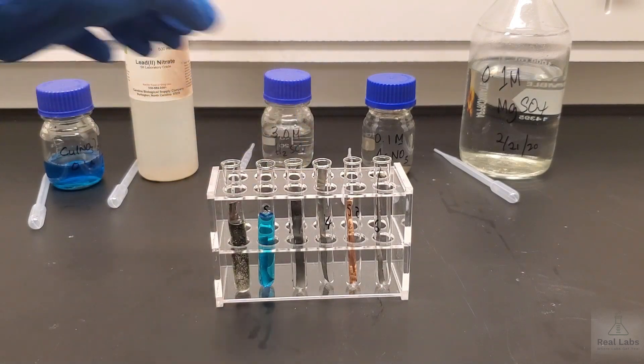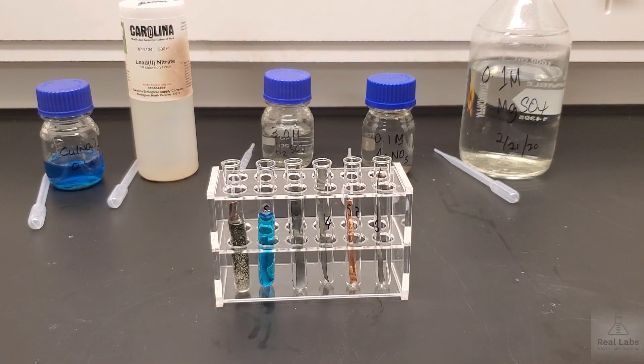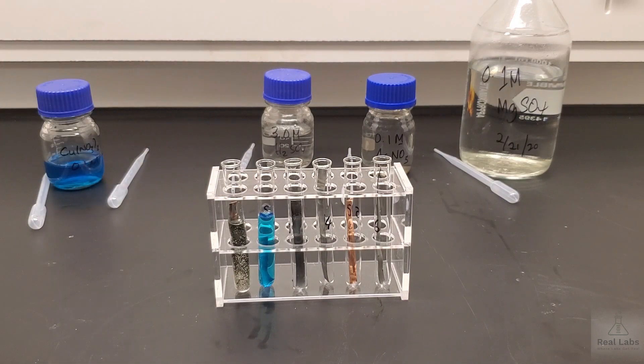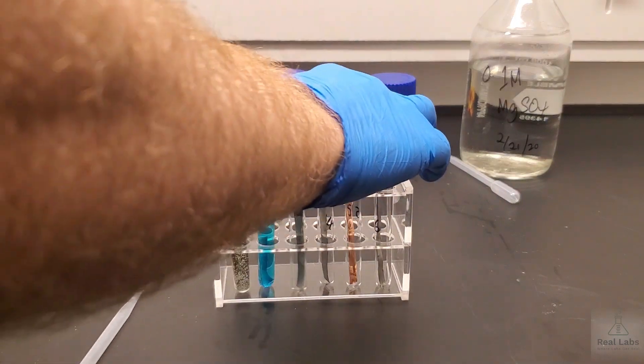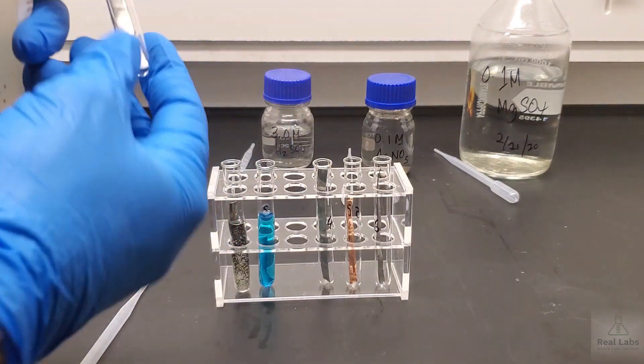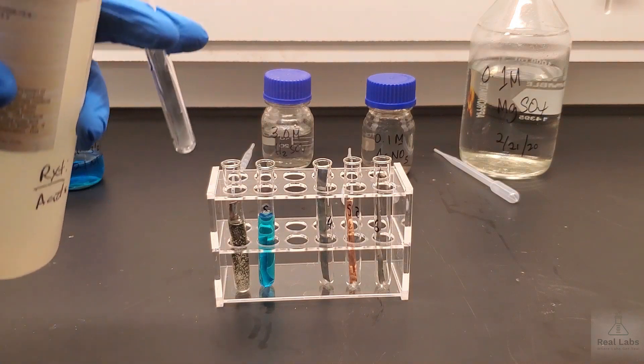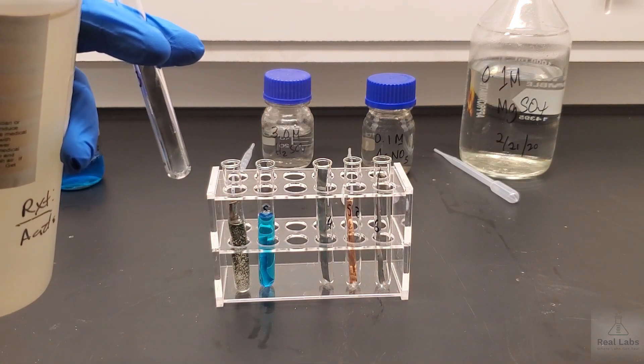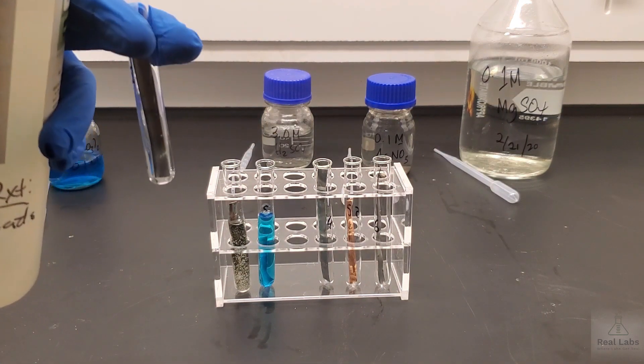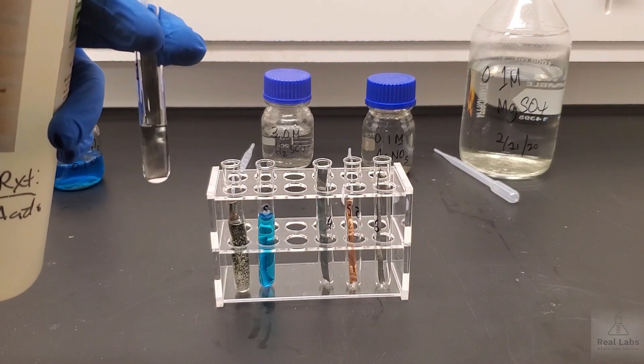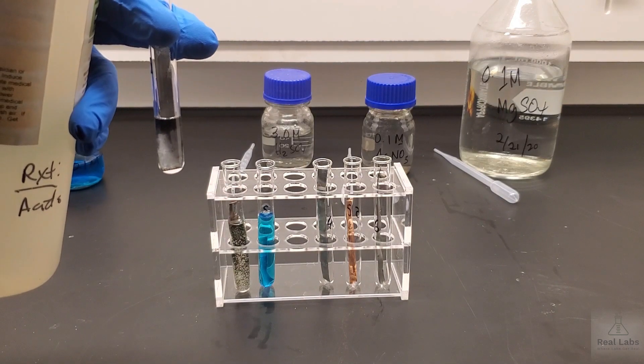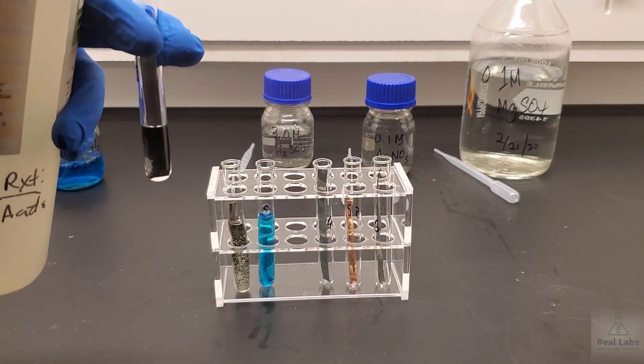In this third test tube here, we have the zinc strip. We're going to add lead nitrate to it. So here's our lead nitrate. We can see if anything will happen here when we add the lead nitrate. It's a fairly shiny piece at the bottom, a little bit dirty on top, but the bottom we can look at quite clearly. That's nicely cleaned.